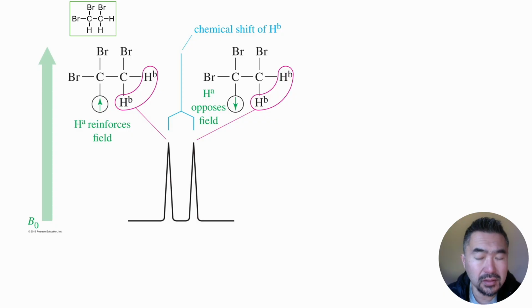And right, let's take a look at the more detailed reason why these split the way they do. This is basically the same molecule as the one on the previous slide, except chlorines are replaced with bromine atoms. Here we're taking a look at the signal corresponding with these two protons, which are equivalent, and which are split by their single neighbor, that proton, into a doublet. And why is that? Well, remember we're looking at the signal for these two, and its neighboring proton could sometimes be in the alpha spin state, which is the same direction as the external magnetic field.